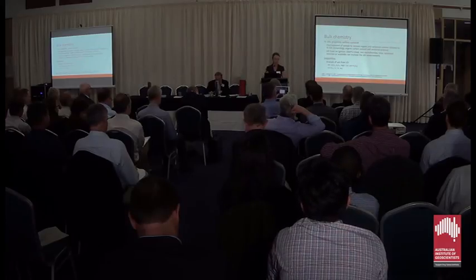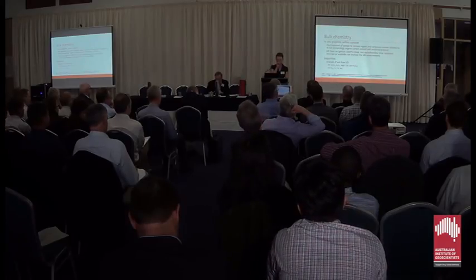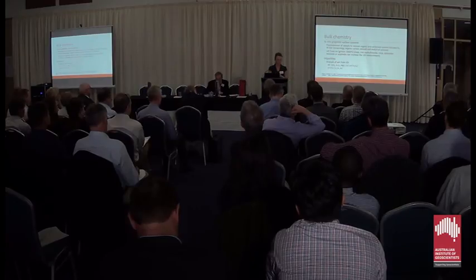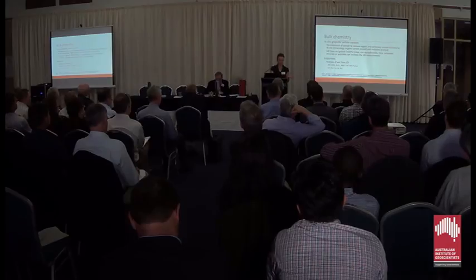So if your sample has more, say, carbonate material than a usual sample that was used for method validation, you may need to spend more time to remove the carbonate content.